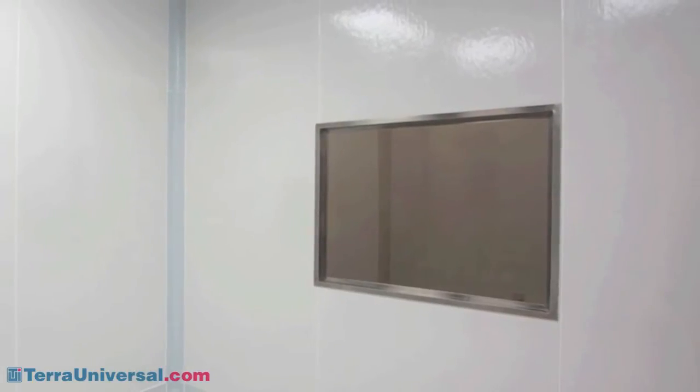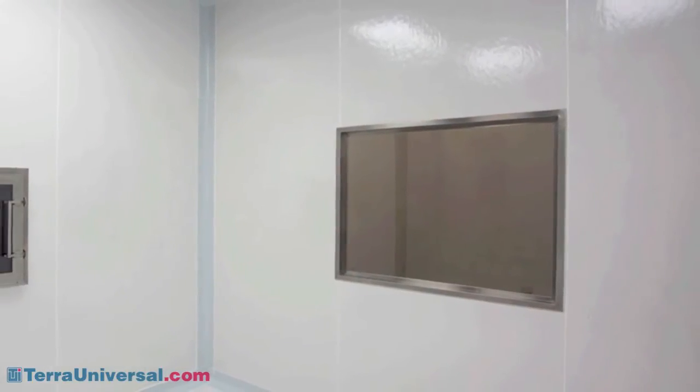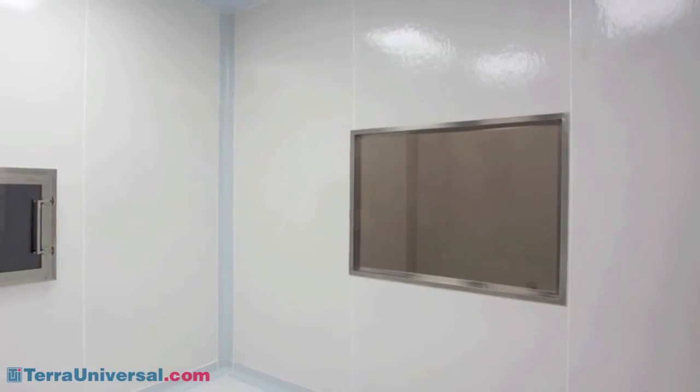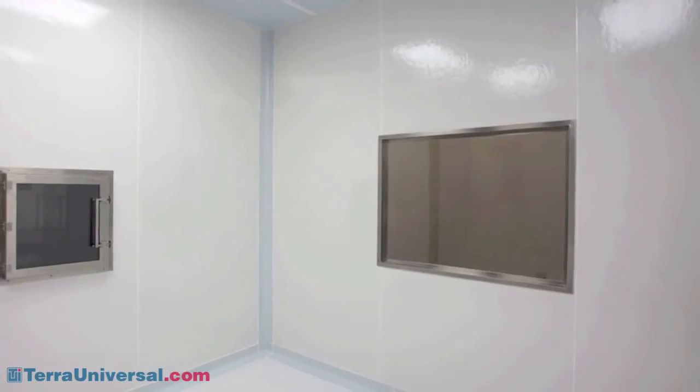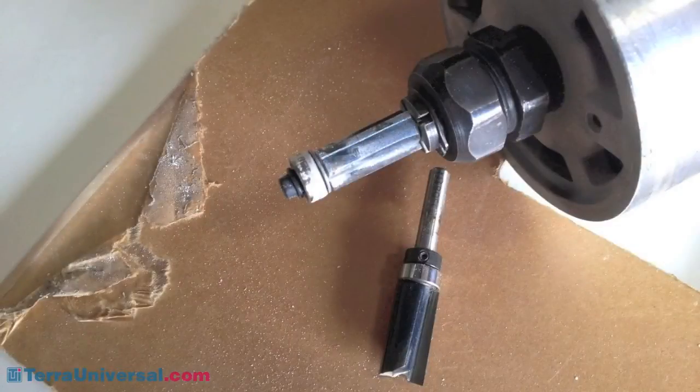Third, any wall obstructions including windows, air vents, and outlets should be installed in wallboard cutouts before the FRP panels are applied. Use a router to make these cutouts in the FRP panels.